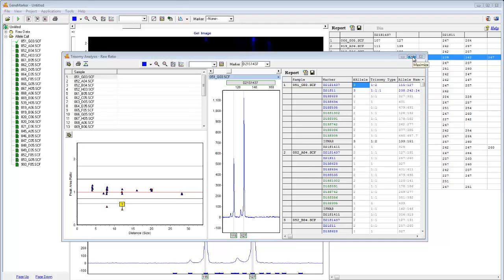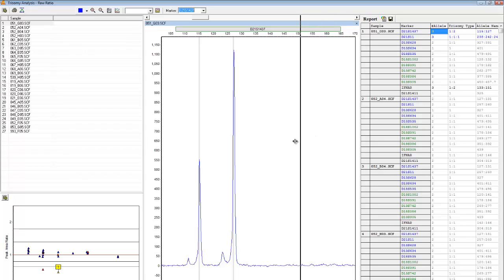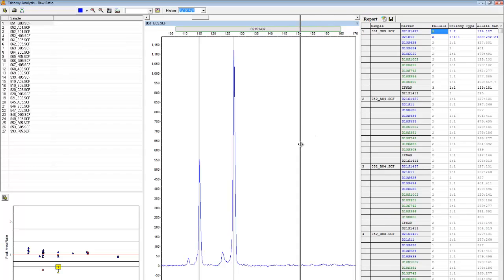Results are displayed in the Trisomy Analysis window. This window includes a file tree to the left, a ratio plot below, the electropherogram in the center, and a report table to the right. Each of these windows can be resized for easier viewing.